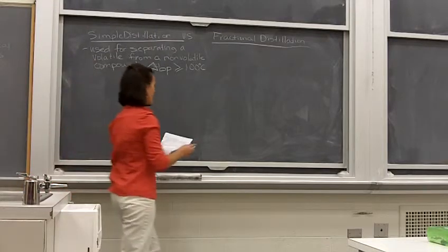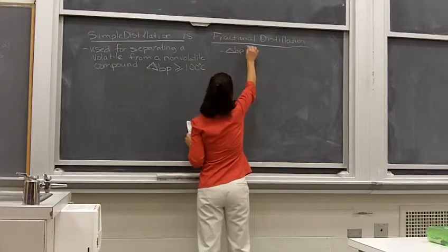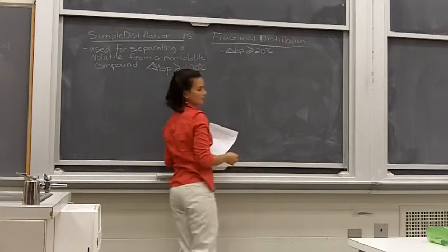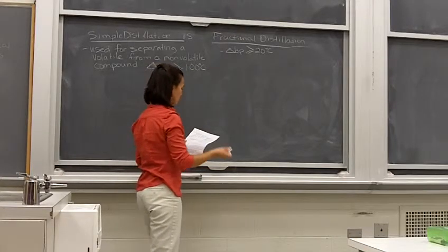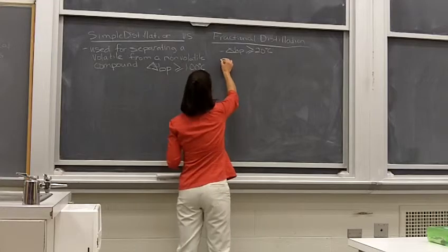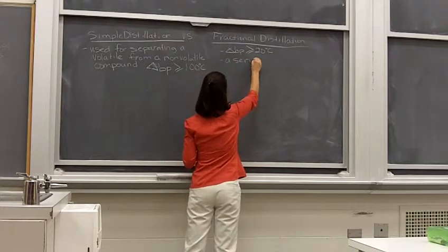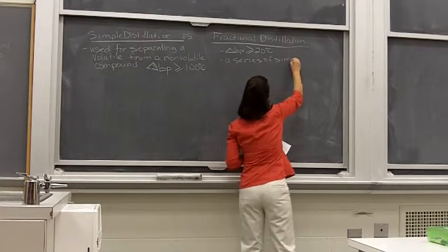With a fractional distillation, you can distill components that have a 20-degree difference in temperature and separate them. And so what is involved in a fractional distillation is it's actually a series of simple distillations, all in one apparatus.